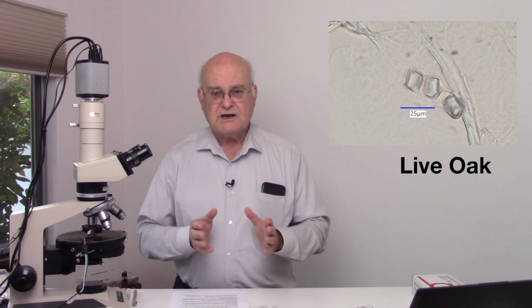When these are exposed to higher temperature, the shape stays identical, but the optical properties change. They become light scattering. The importance there again of reflected dark field illumination. When you look at a fresh calcium oxalate phytolith, it's a nice clear crystal.